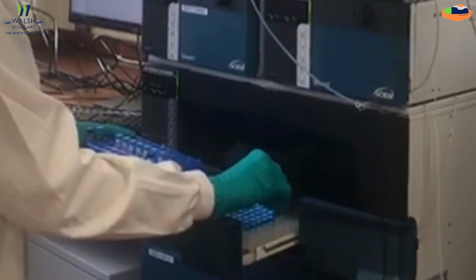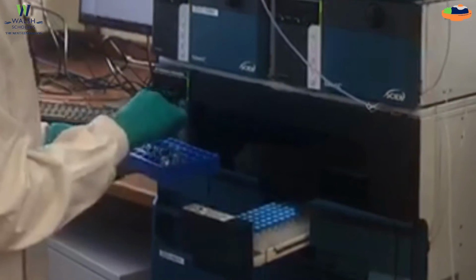As well as it being a lot quicker, it's also greener because the conventional approach would use about 18 ml of solvent per sample, whereas now I'm only using 10. So all in all, this method is a lot quicker and efficient, and it has reduced the sample turnaround times from 4 days to just 1.5 days.